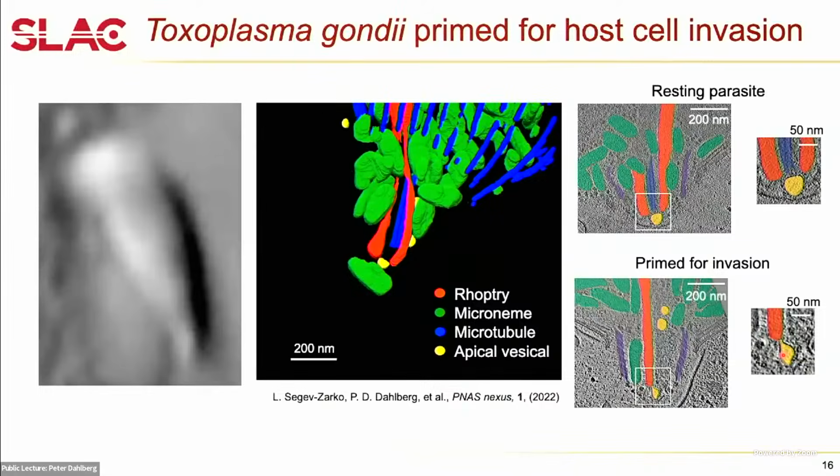At this point, you might be saying, but I thought you said you had 0.002 nanometer wavelength, that you could resolve all the biomolecules. Well, it turns out electron tomography isn't limited by diffraction of the electrons. It's limited by something else. The resolution of electron tomography is limited by something that we call radiation damage. So as these very energetic electrons come in and interact with the sample, they do things like break bonds and degrade that high resolution information very quickly. And in practice, that limits the resolution of electron tomography to more like 4-ish nanometers. And that resolution is too low to identify many of the biomolecules of interest.